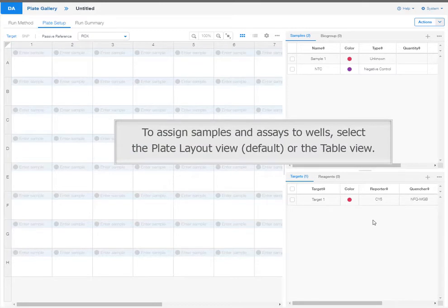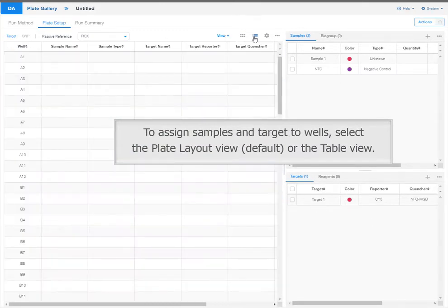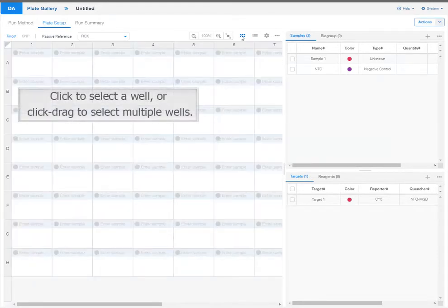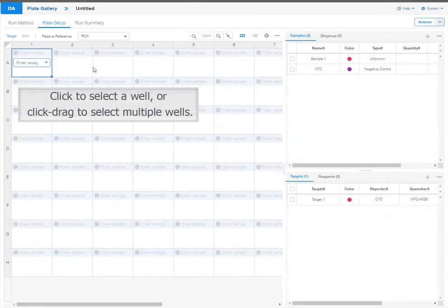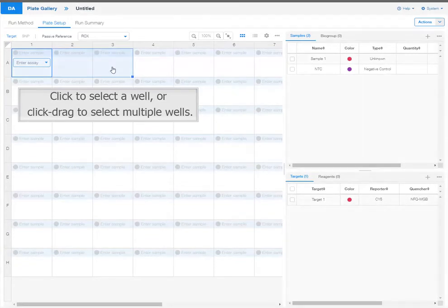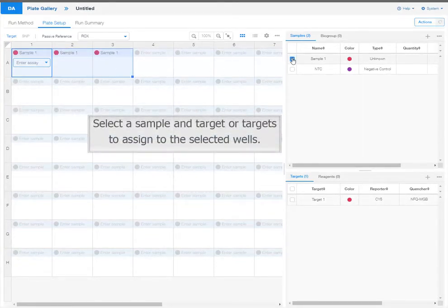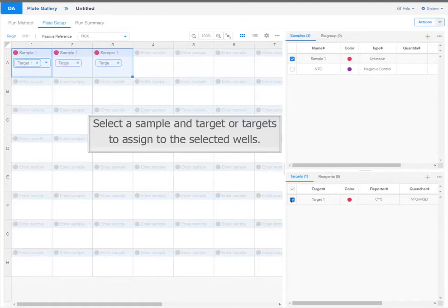To assign samples and assays to wells, select the plate layout view or the table view. In the plate layout view, click to select a well, or click and drag to select multiple wells. Select a sample and target, or targets, to assign to the selected wells.